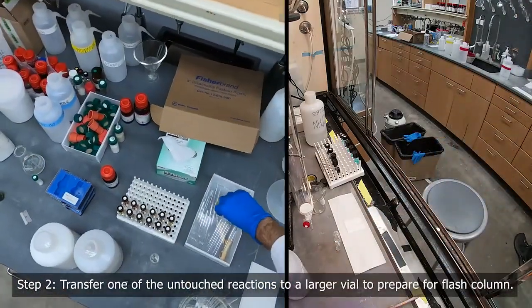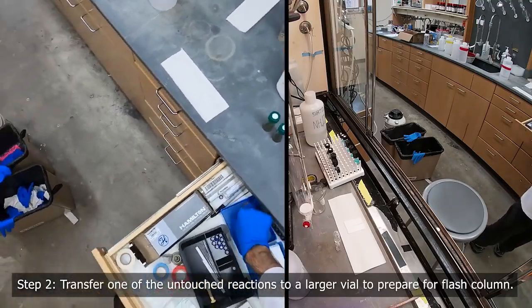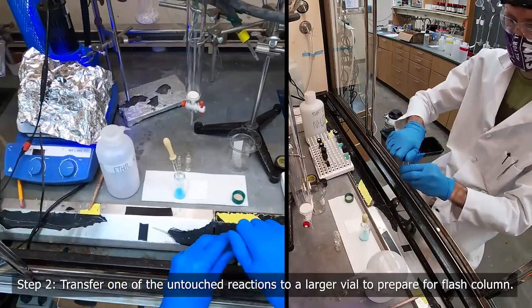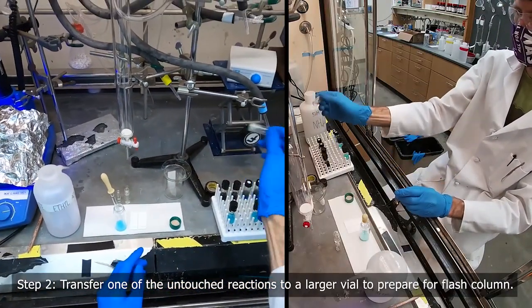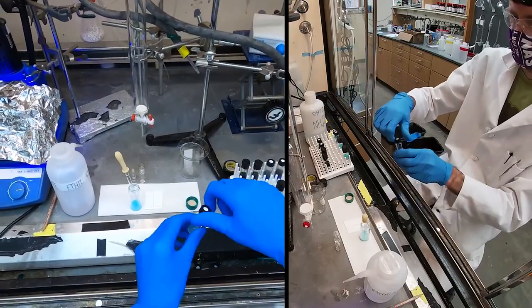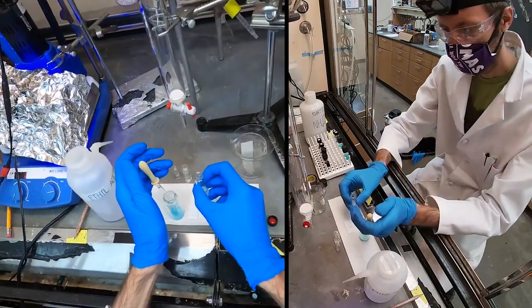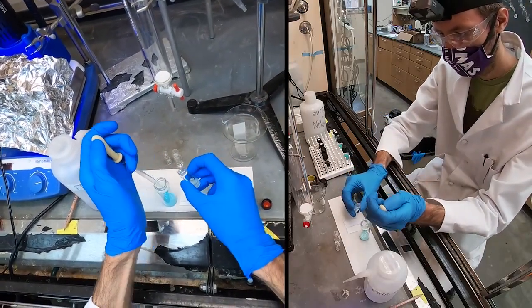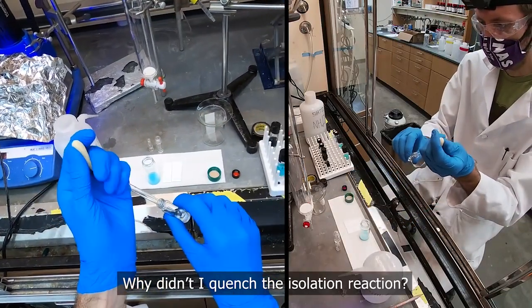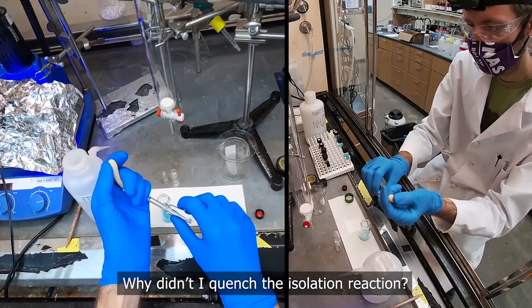And while that's running, we'll actually transfer our reaction that we're going to isolate into a vial. So we'll just transfer this. I'm going to do a lot of shaking. Make sure I get absolutely everything out of this vial and into the bigger vial. And you'll notice here that I did not quench this reaction. I did not add my aqueous solution.